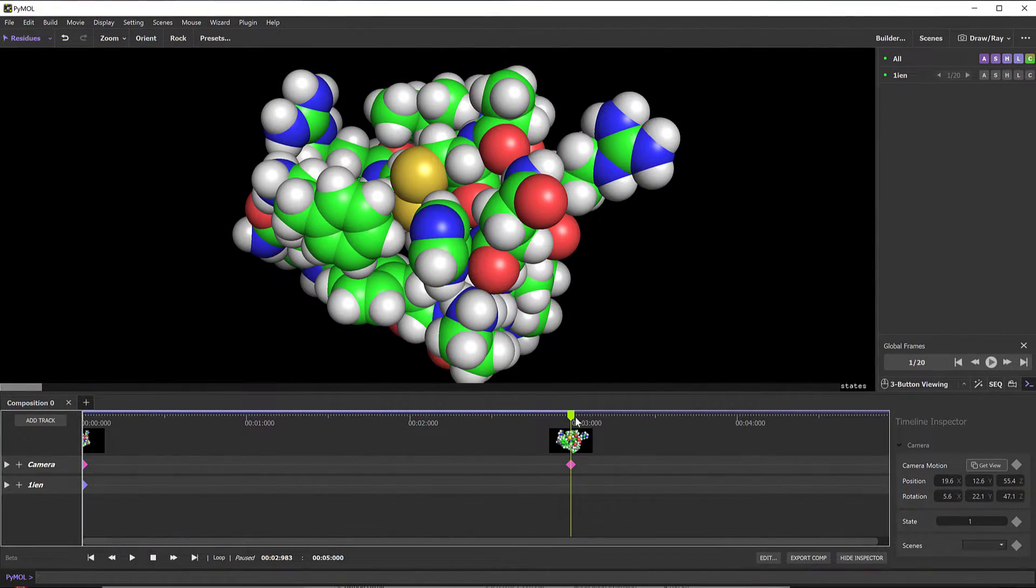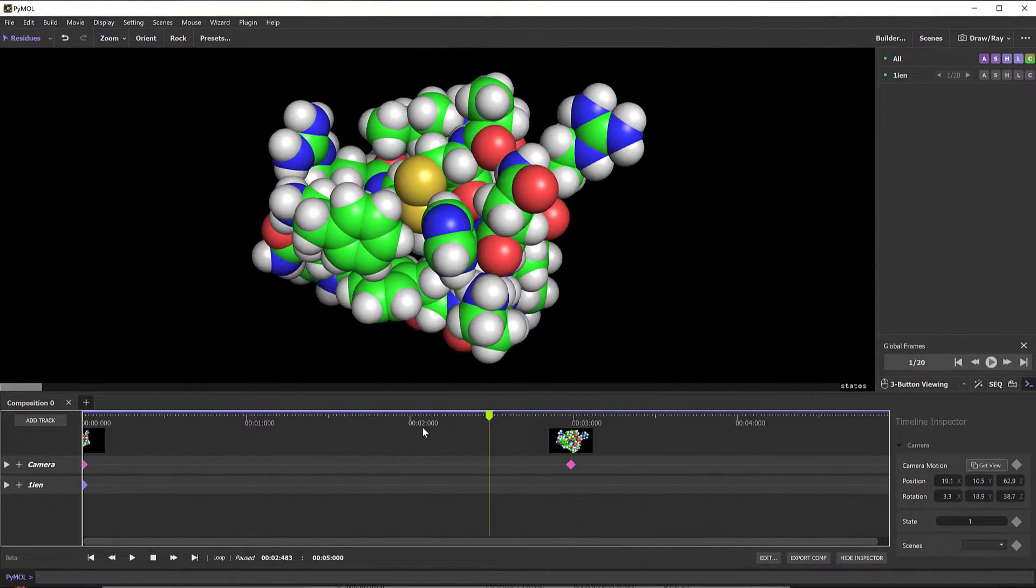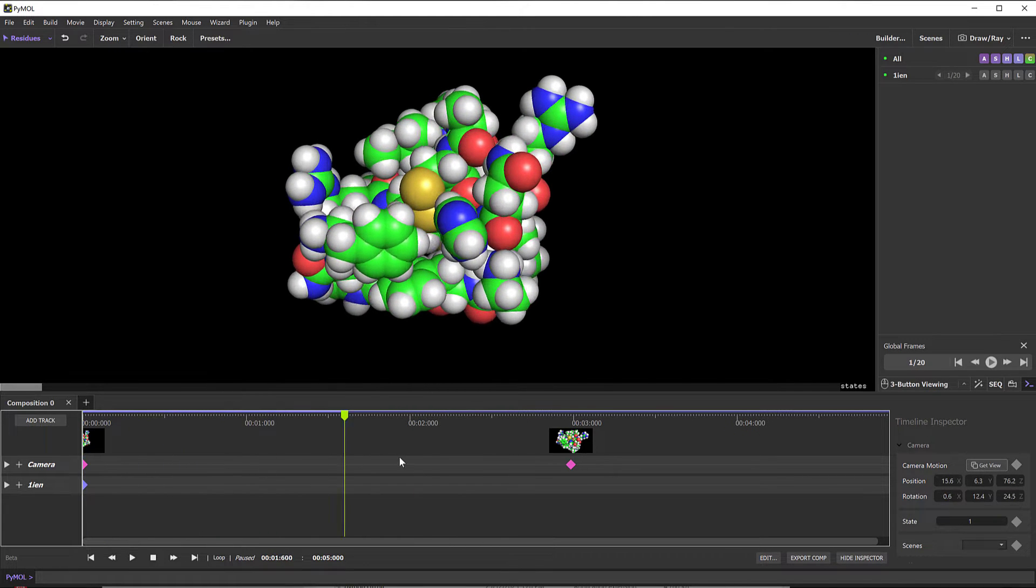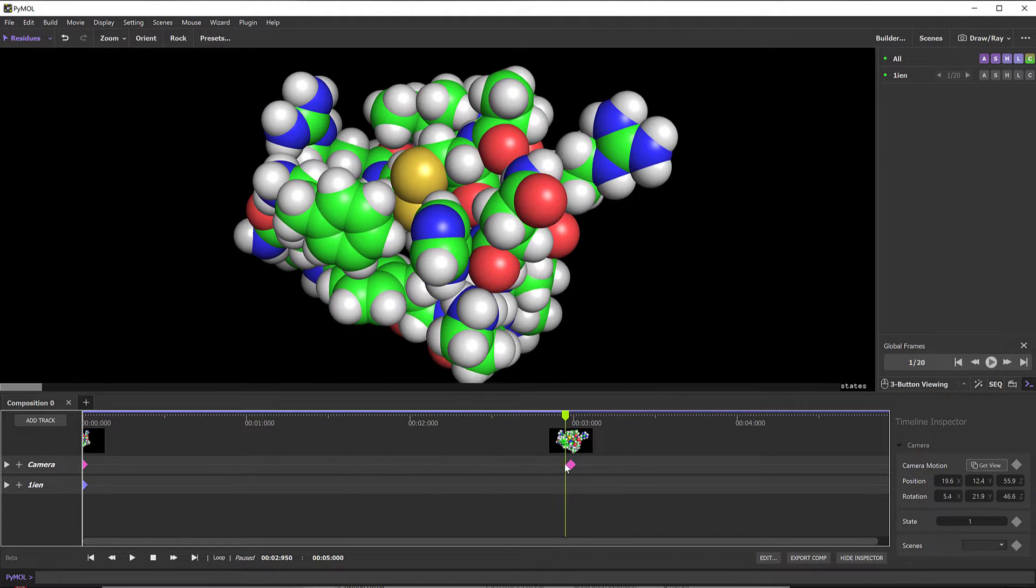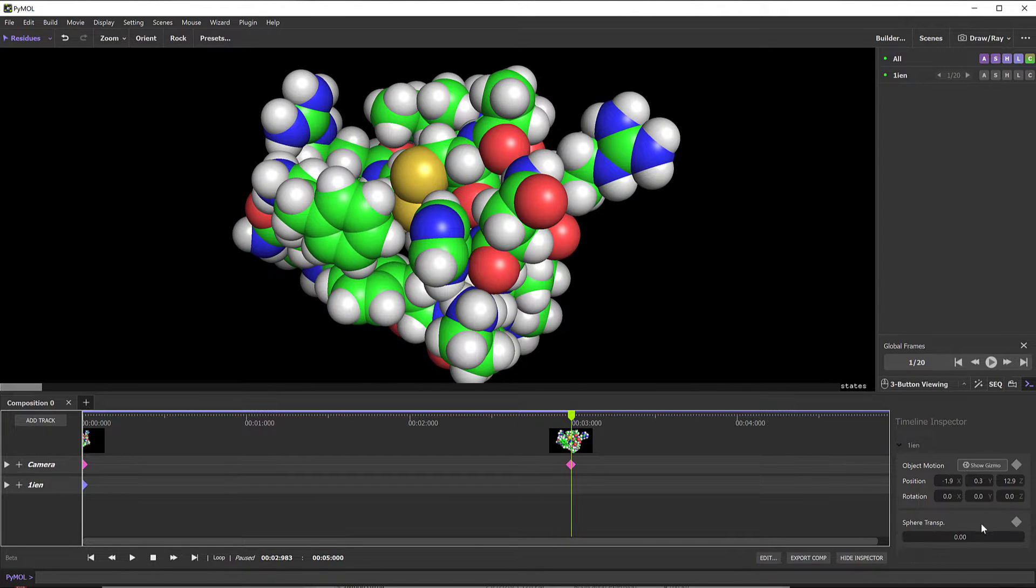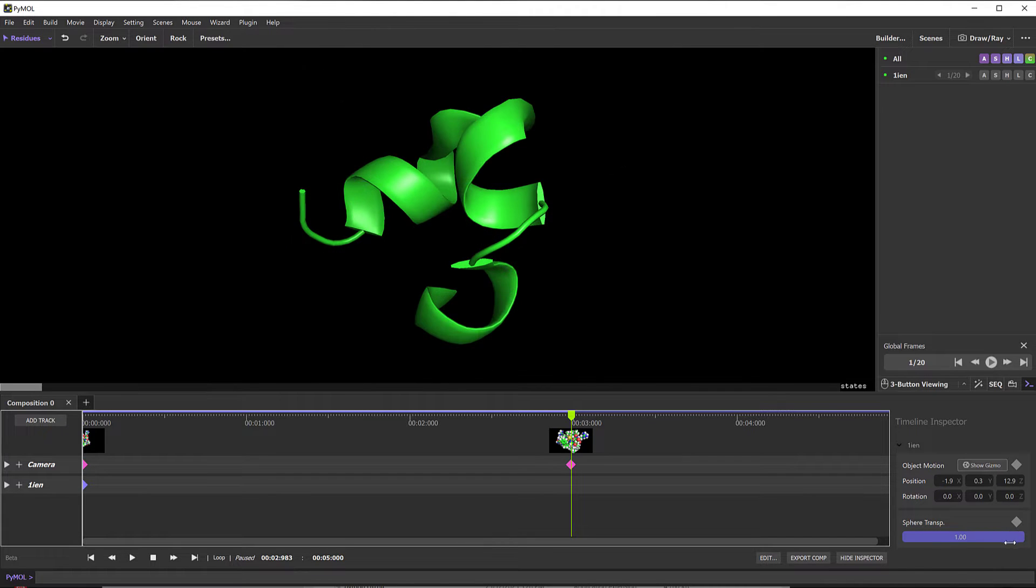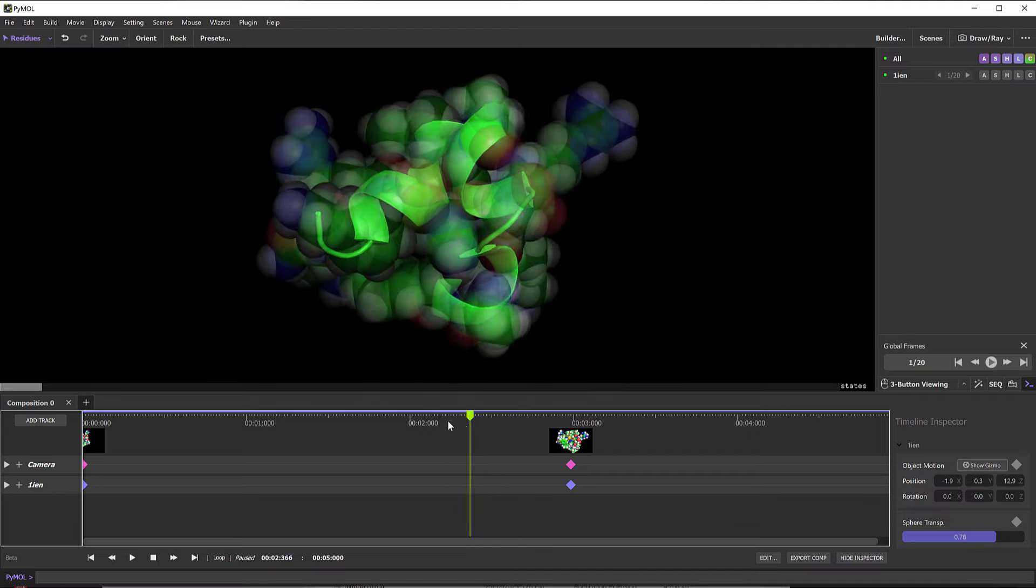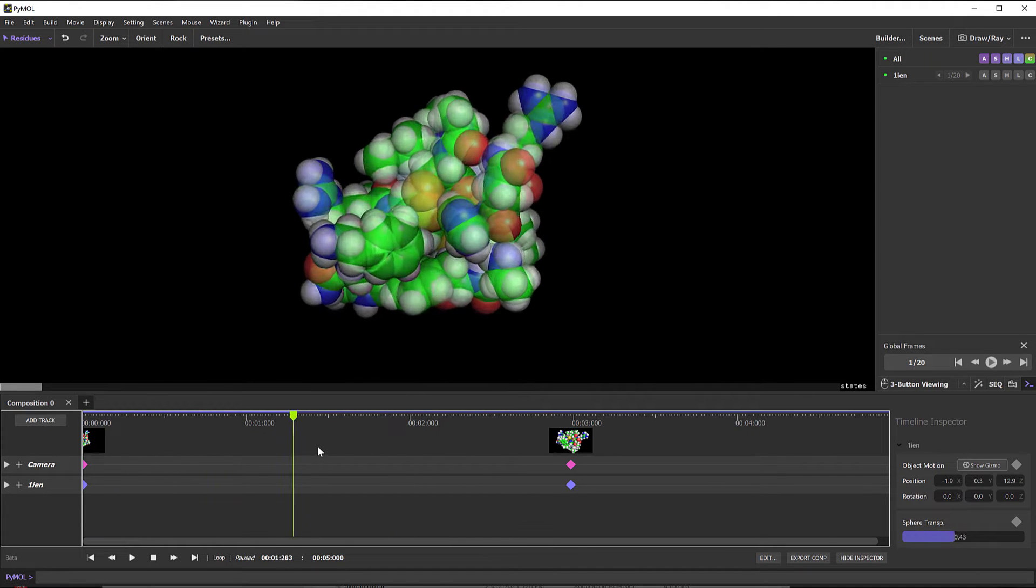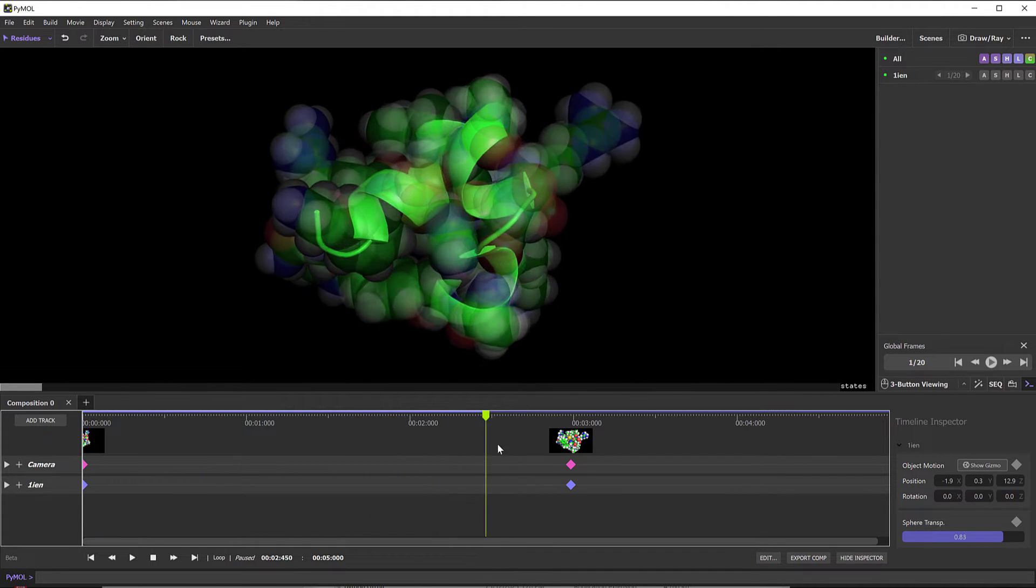With the introduction of the new movie timeline, one can effortlessly create and share modeling results from the Schrodinger suite through PyMOL animated movies. And the inclusion of inspector controls empower everyday users to elevate the quality of their movies to the next level.